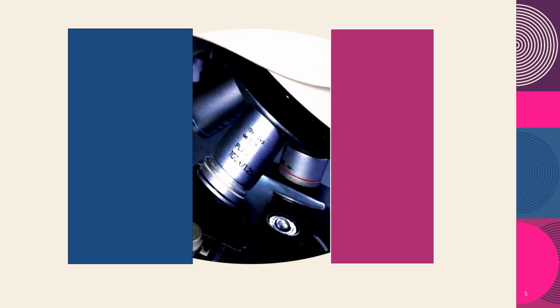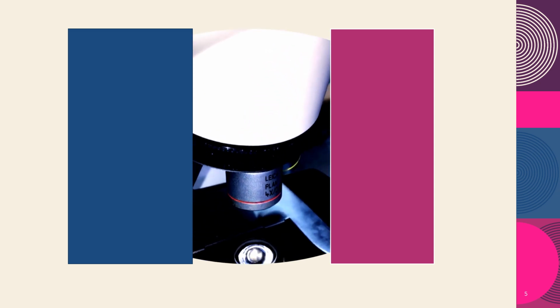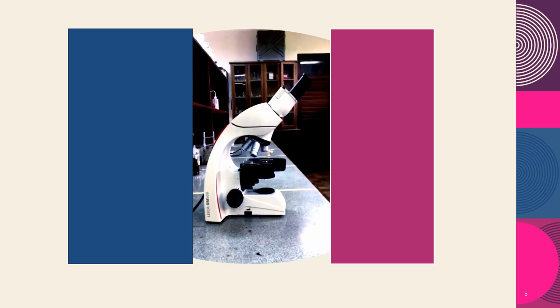So let's go along and view the other parts. What we see here are the objective lenses. If you observe closely, you will see that the objective lenses are color coded and they have their magnifications etched on them. So what we have in view right now is the ×4 objective lens. It is red color coded. This is actually a Leica microscope, so you can see that this is the ×10 objective lens.